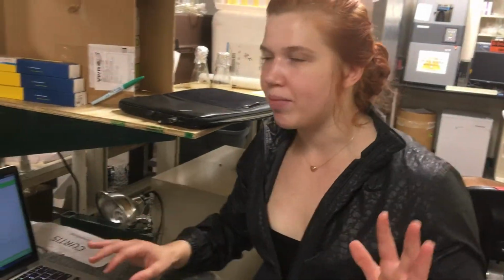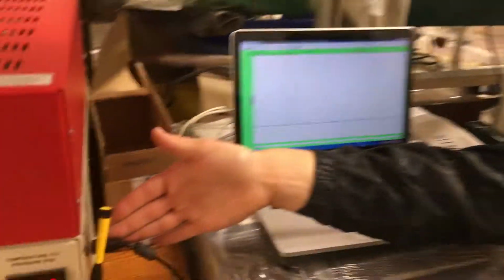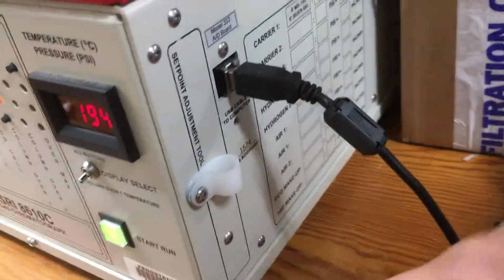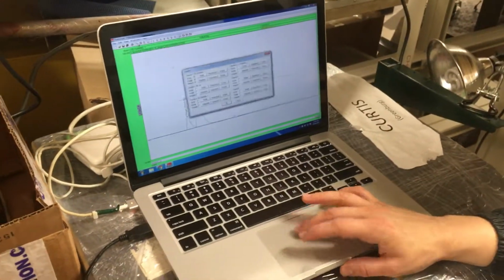Well, one more thing maybe to talk about. It's not always clear how to connect your channel, and so obviously there's a USB connection between the GC, and it has the USB address 1574, and it connects to your computer clearly. You want to make sure that you are connected to that, which I believe is in details.